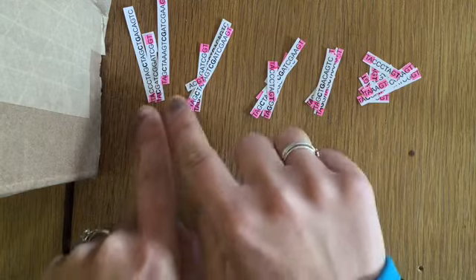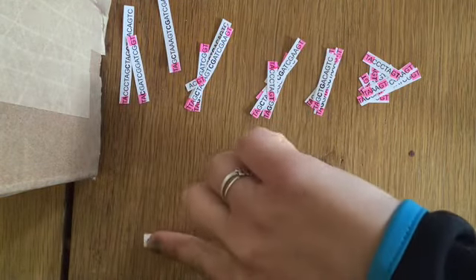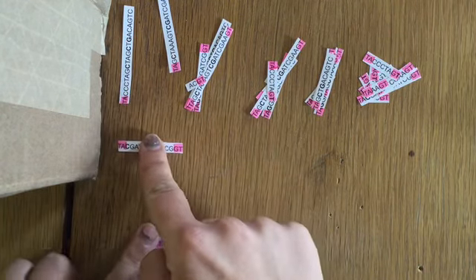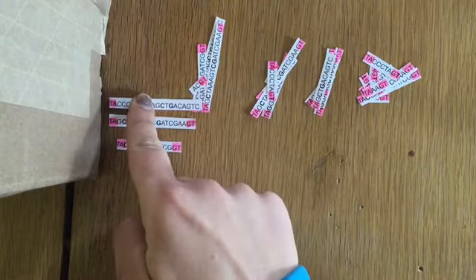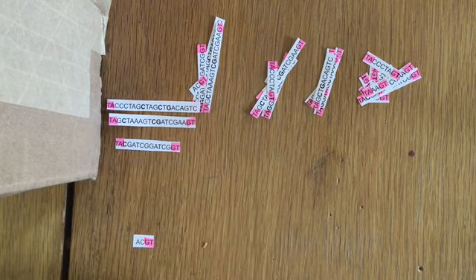So if we just do this with one well at a time, this little tiny piece is going to migrate all the way down there. We have a bigger piece that's probably going to get caught right about there. We have another bigger piece and a piece that's a little bit bigger. So those are going to make bands that are a little bit closer together.